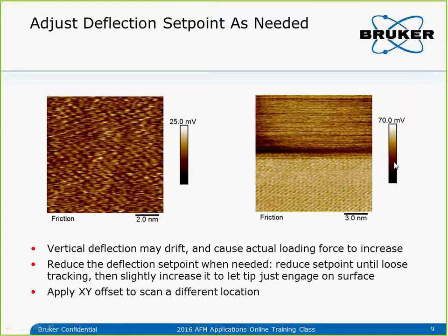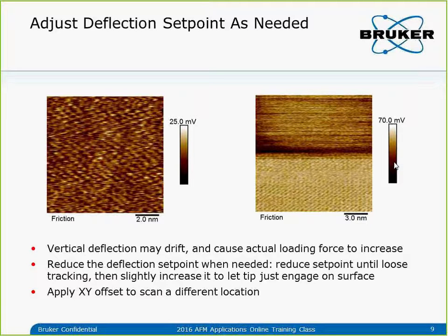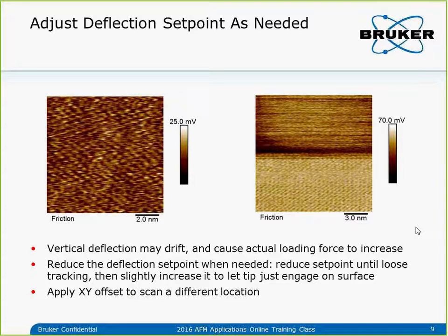When this happens, we need to adjust the deflection setpoint. Reduce the deflection setpoint until the tip retracts because it's below free deflection. Then increase the setpoint by 0.1 to 0.2 volts to let the tip just land on the sample with very small force. If the tip is scratching or crashed somewhere, I will use offset X or Y to move to a new location to scan. This is how we keep the force small to prevent tip crash and keep it sharp.